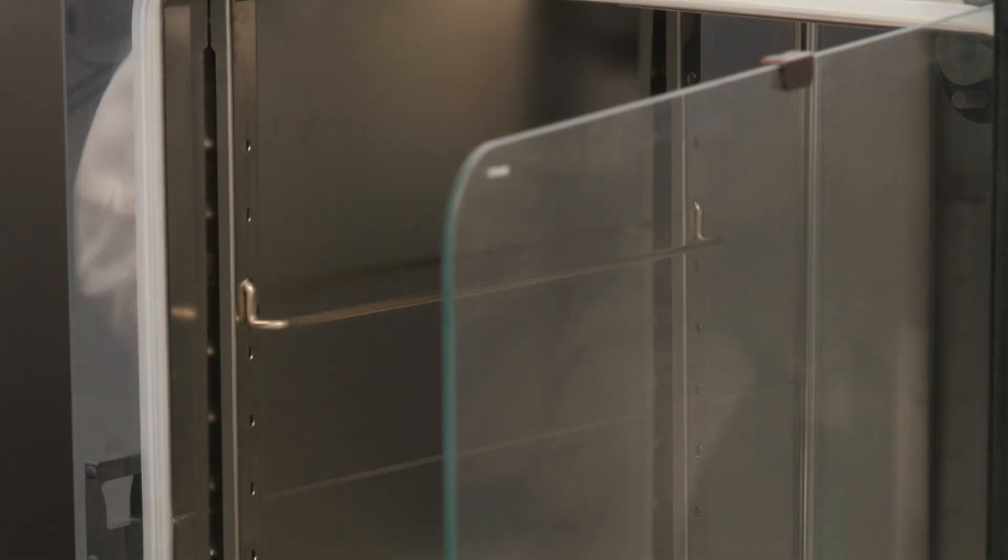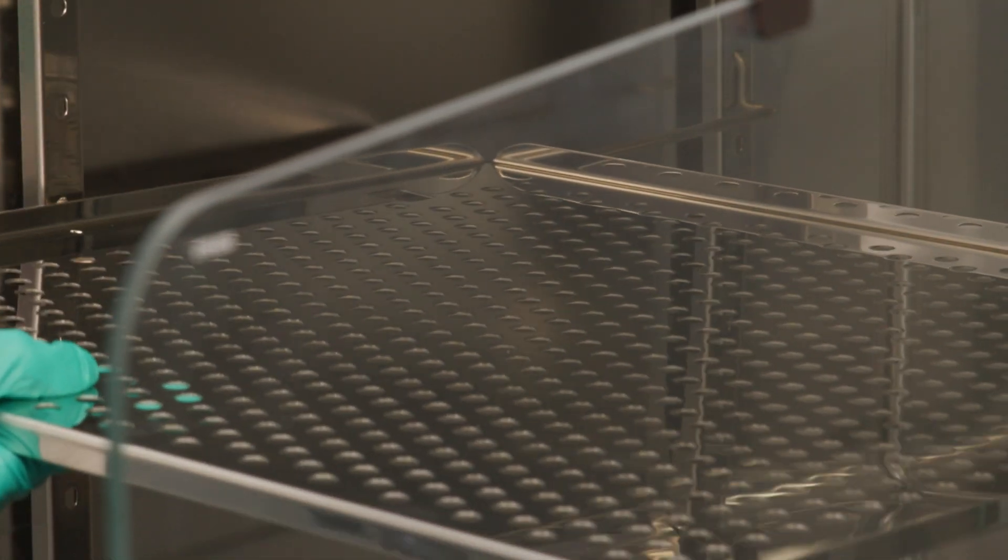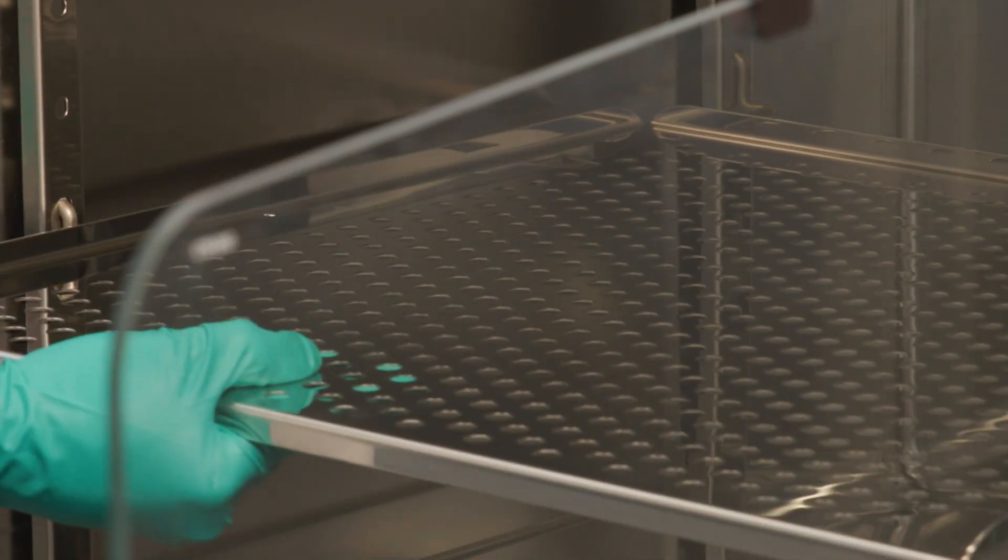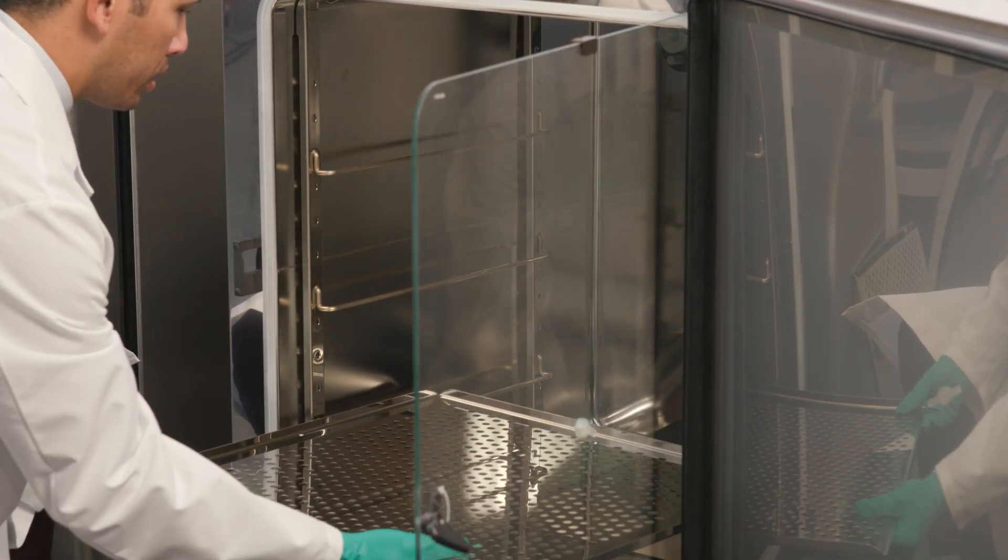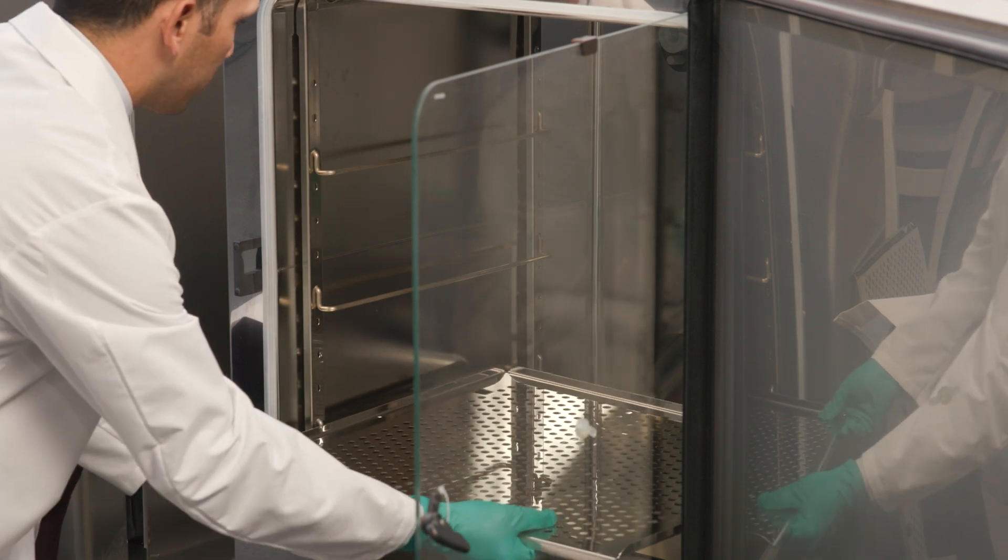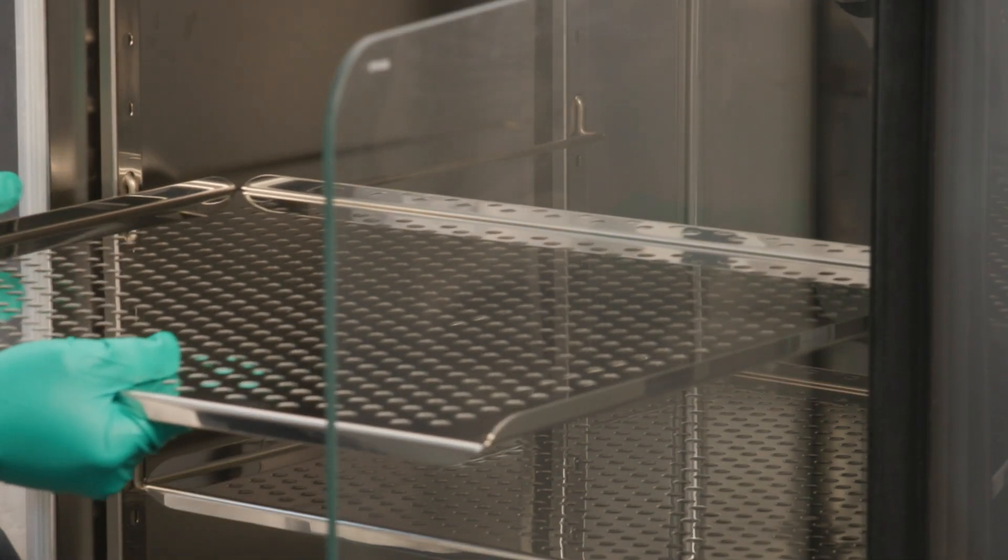To install the shelves, slide the shelf with the tilt protection device onto the shelf support. The tilt protection is also used as a guide for the shelf. Then, slightly raise the shelf so that the withdrawal stop can be routed over the shelf supports. Finally, make sure that the shelf support is positioned in the two tilt protections in a way that allows it to move freely.